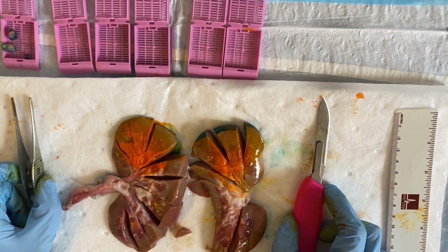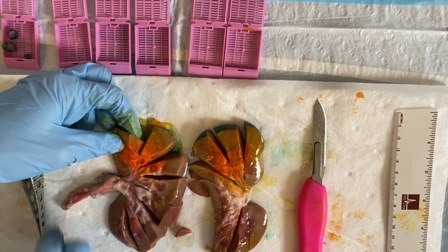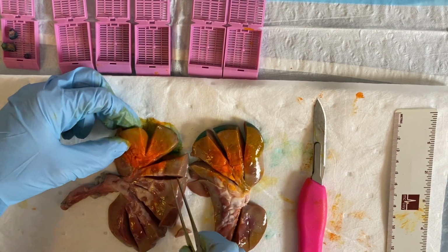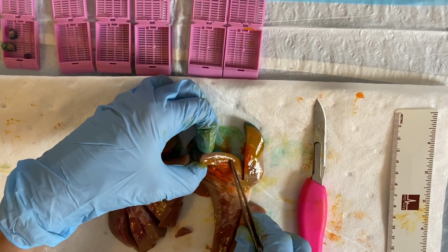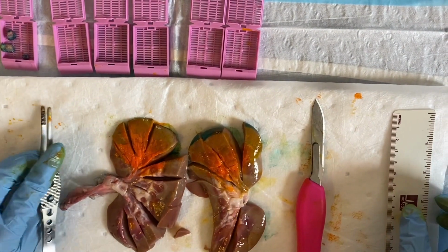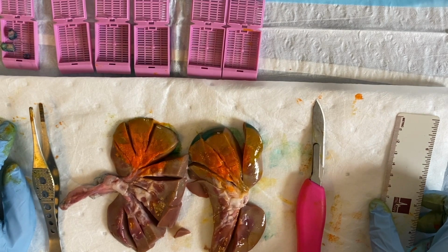You will want to measure the lesion in 3 dimensions, remembering that there is tumor on both halves of your kidney. As you can see, I have tumor here that extends in this orange ink past my initial cut. Additionally, on this half, I also have tumor here. So what I would need to do is make sure that I get the greatest dimension of all 3 axes in order to get my most accurate tumor measurement.